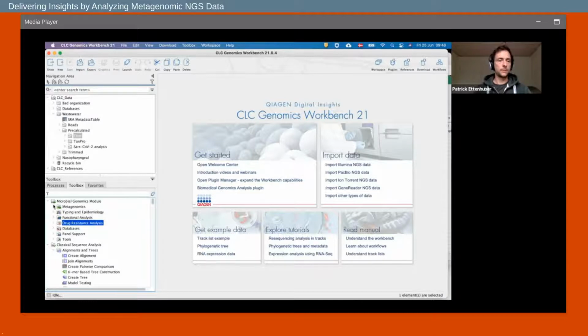So the taxonomic profiling tool is of course to be found under metagenomics, and there we can have two different ways of analyzing metagenomic data, that is either amplicon based or taxonomic analysis. In this case it's not amplicon based but whole metagenome sequencing, or targeted metagenomic sequencing rather. Furthermore, there is an abundance analysis folder, which we'll look later into, which contains all the tools for statistical analysis of metagenomic data. So, the taxonomic profiling tool can be found here.